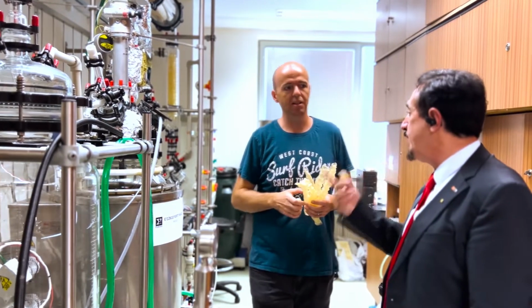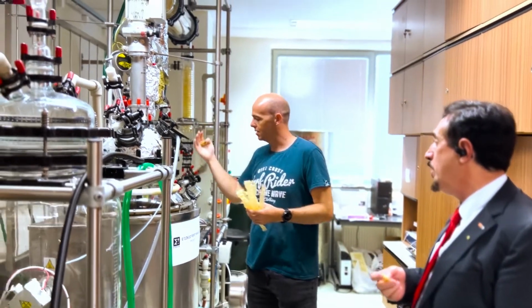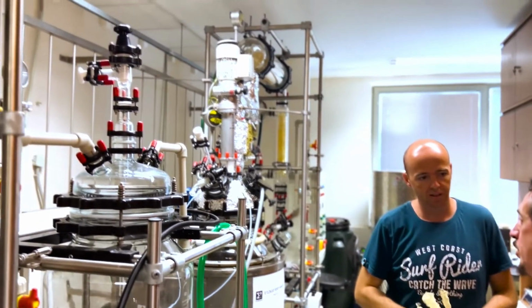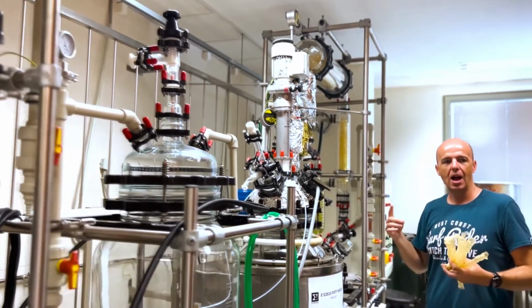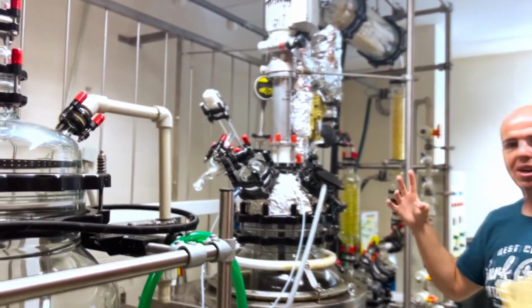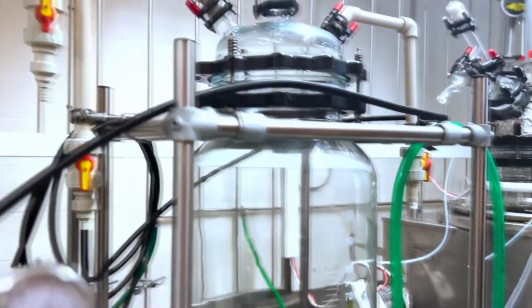But is the stirring a mechanical issue? Yeah, stirring. You can see the stirrer is an electronic stirrer. What was the problem with the stirring? I don't know how to explain. The stirrer is like steering, so the casings are tangled around the stirrer. Okay, it's tangling. So it's a mechanical issue. Yeah. It's not a process issue.